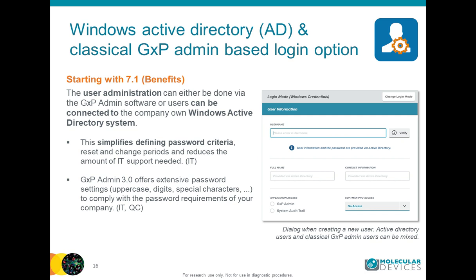In order to maintain such a workflow system, one needs a user administration. Because to maintain this workflow system, we need an administrator who creates the individual accounts. We need a scientist, a lab manager, and a lab technician, who all have different roles and permissions. As well as, in order to enter SoftMax Pro GxP, you need to log in.